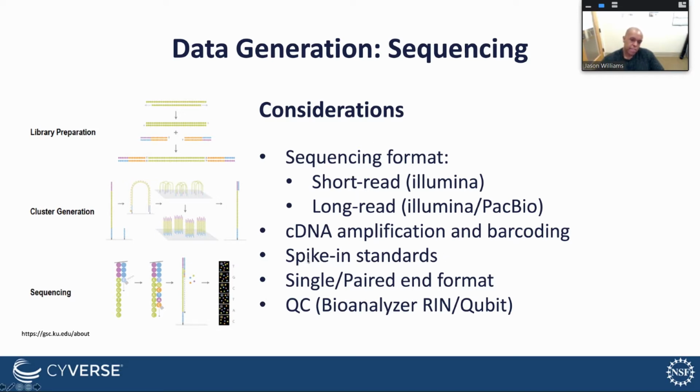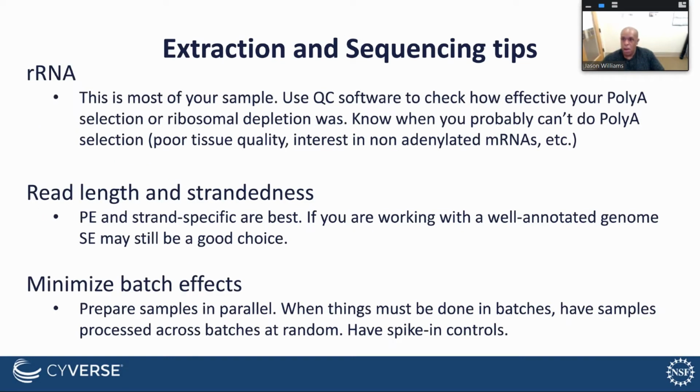That may apply in the sense of, can you use a spike-in, which is essentially a known amount of an RNA that is not something you care about, maybe from a different organism that is not going to contaminate, but if you have a known truth of what different RNA or cDNA concentrations are, are you really confident that your experimental setup and sequencing setup is measuring those things accurately? Those are good things to pay attention to and give you some controls.